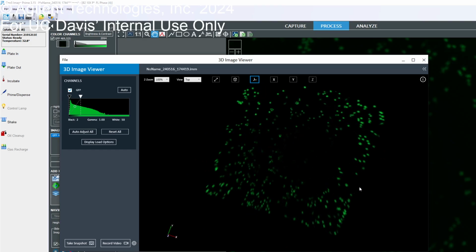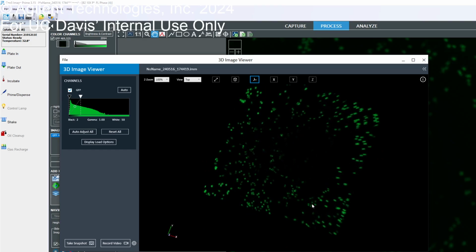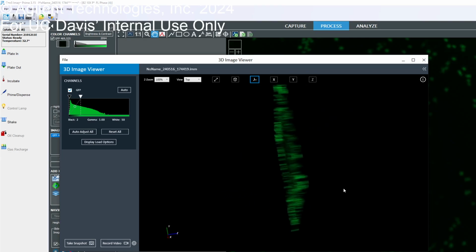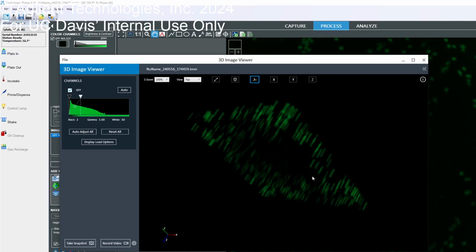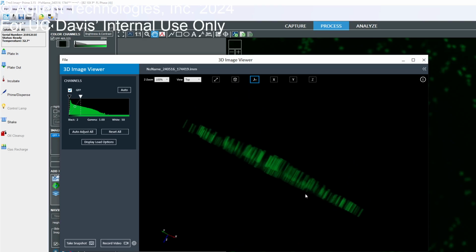Is it designed for tissue slices or histology? It exists, but let me say it differently. We have not updated this in a very long time, so it's not perfect. Yeah, but it's not the best for microglia, probably. No, this would look exactly like this even if you do it elsewhere because this is just a 2D sample.